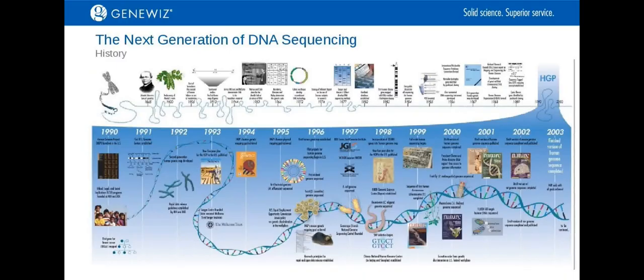First, before we talk about this, it's vital to understand the backstory. Sanger sequencing was developed by Frederick Sanger in 1977. This method spurred many scientists to start incorporating sequencing into their research. Shortly thereafter, polymerase chain reaction, or PCR, was invented. Coupled together, scientists could now sequence small pieces of DNA quite easily.